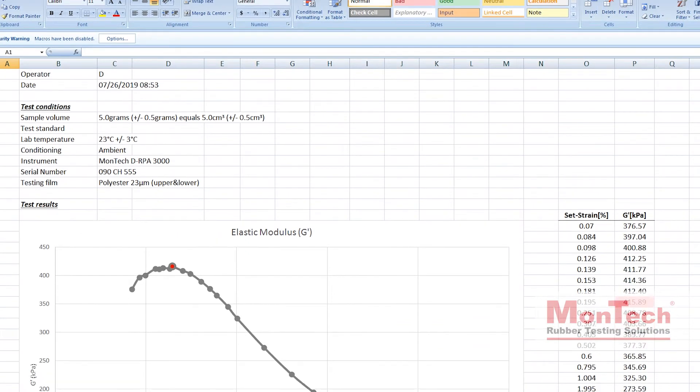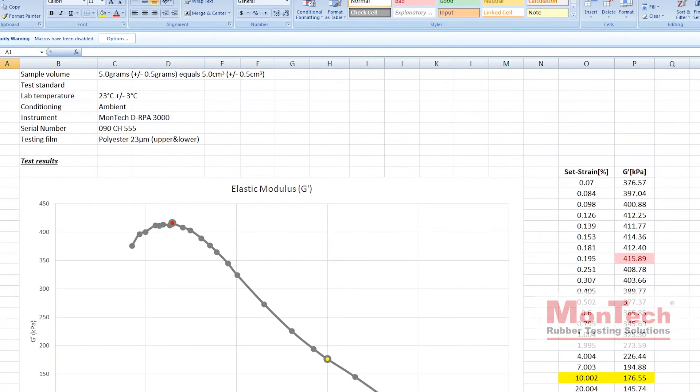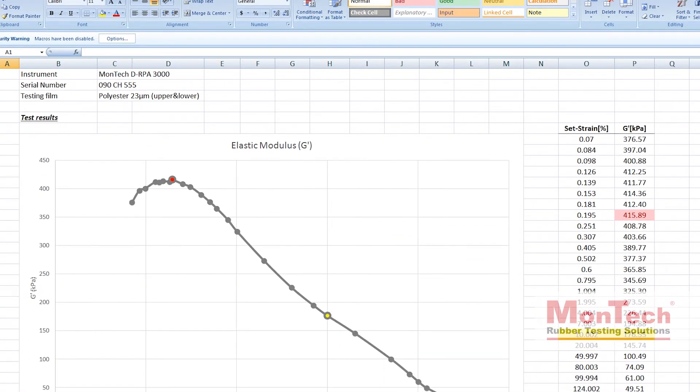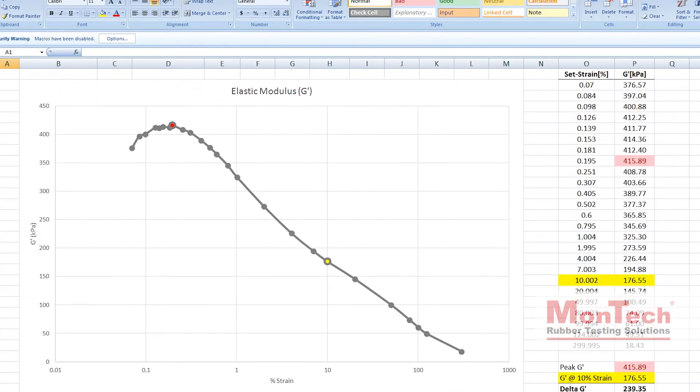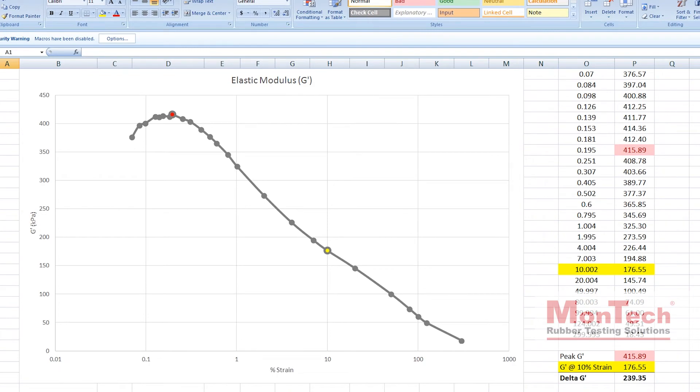After the strain sweep, the resulting data is automatically parsed by MonControl into a fully customized report.